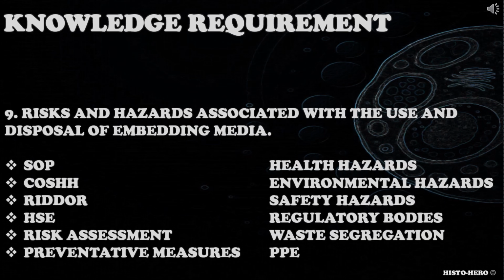The ninth knowledge requirement is for you to know risks and hazards associated with the use and disposal of embedding media. Similarly to the previous requirement, what embedding media do you use in your laboratory? What are the risks and hazards associated with the use and disposal of embedding media? How would you mitigate those risks and hazards? Consider health hazards, safety hazards, environmental hazards, COSHH, SOPs, PPE, regulatory bodies, waste segregation, risk assessments, RIDDOR, HSE, preventative measures and so on.